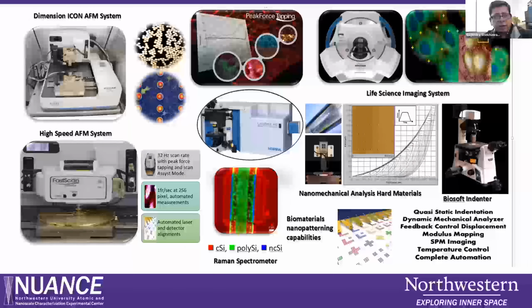In this category we have a bunch of AFMs. Some of the AFMs can do quantitative nanomechanical mapping. You can do piezo response force microscopy, surface potential and capacitance microscopy, Kelvin probe microscopy, magnetic force microscopy. These are fully loaded in most of the AFM systems we have.